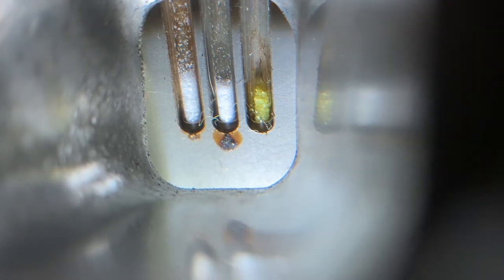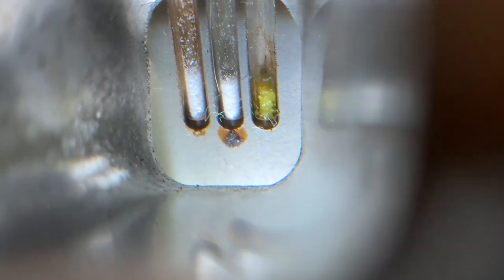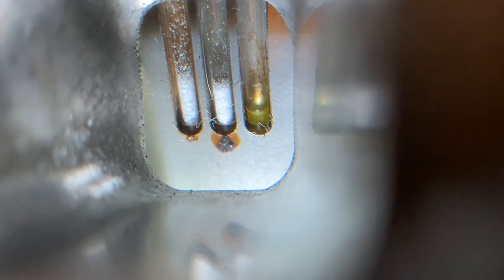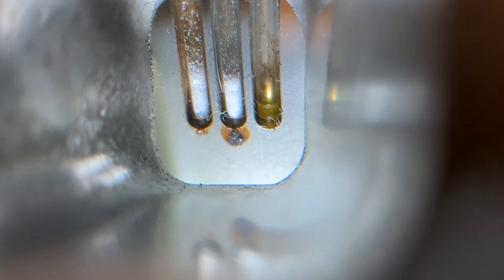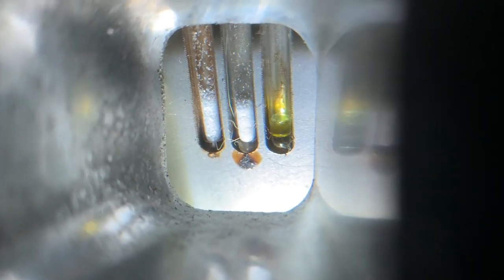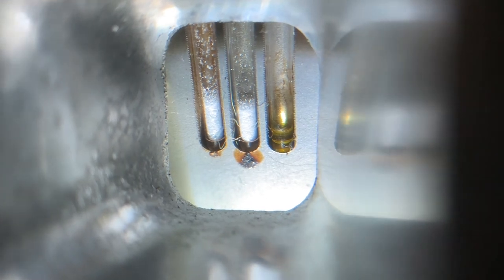So it hasn't even reached the start temp yet, and it looks like 9-fluorenone is shrinking. It hasn't quite turned to liquid yet, but it's shrunk. It's only at 63 degrees Celsius. So that is obvious impurities. So I'm going to have the first start temp be at 65. So it's not quite all melted, but wow, quite a bit of it. It's not even 70 degrees yet. All right, but it just reached 70, or 69.5, so I'm going to click start again, and now it will go past that point at the specified ramp rate. All right, so that's all liquid. That melted 65 to 70. Maybe the literature is wrong, or it was impure.